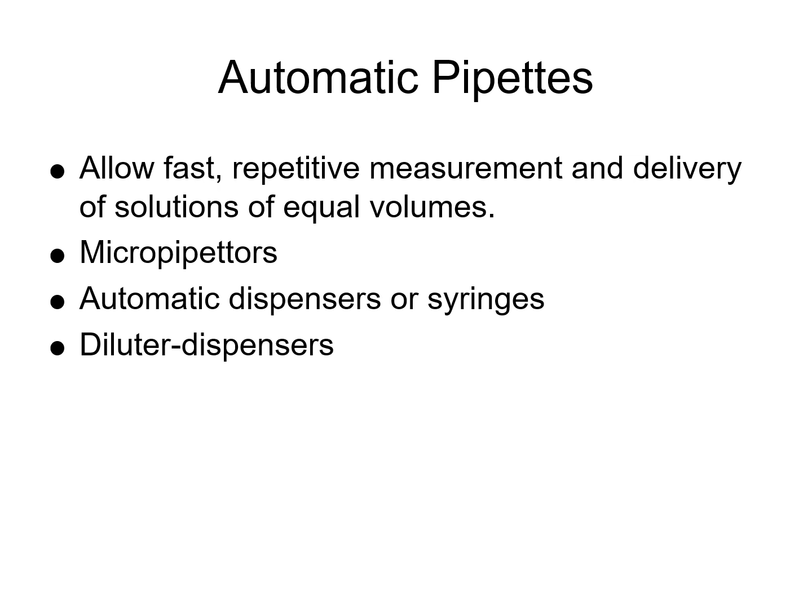For automatic dispensers or syringes, these are mechanized devices that dispense fixed volumes repeatedly. They are suitable for larger volumes and reduce operator fatigue and improve throughput in routine assays.